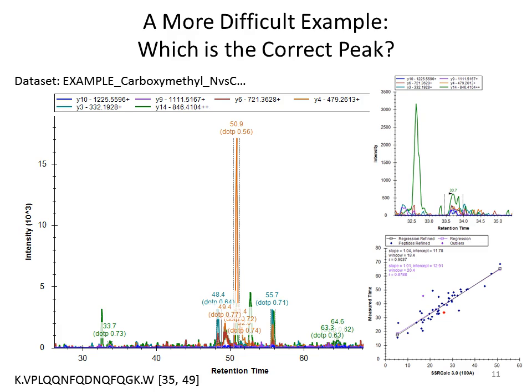And so the real peak is not even this one. I think it's this guy. Yeah. It's this jumbled up little bit of crud. Sorry, I shouldn't say that. And it doesn't even look that much like a peak, because if you zoom in, this is what you see. But the thing that you get here is that every single transition lifts off from the baseline. And the way that, visually, I screen these peptides, I look for just that little white bit and nothing on the baseline.